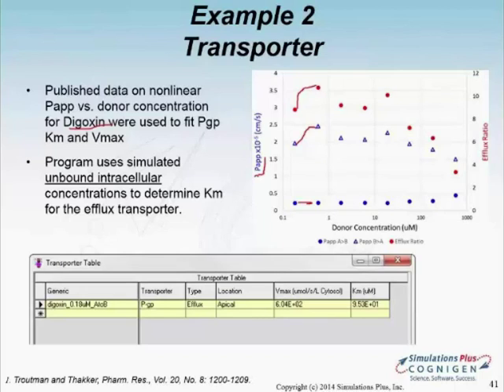So it's based on similar theories, looking at log D versus log P, the same type of model we are using also for the entry rates for neutral versus charged species.